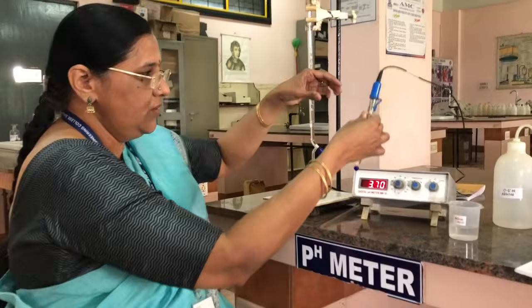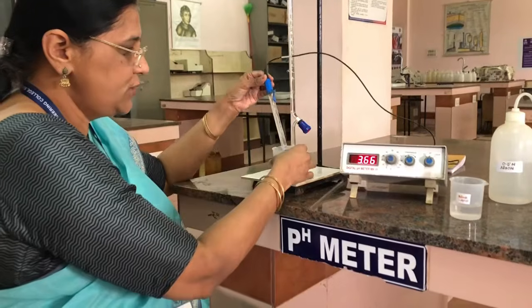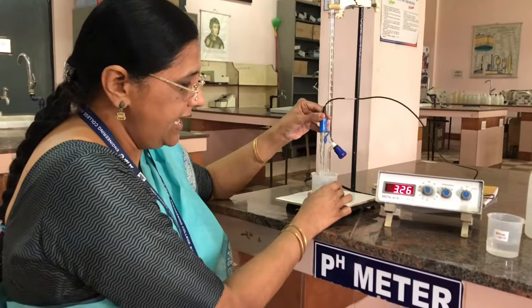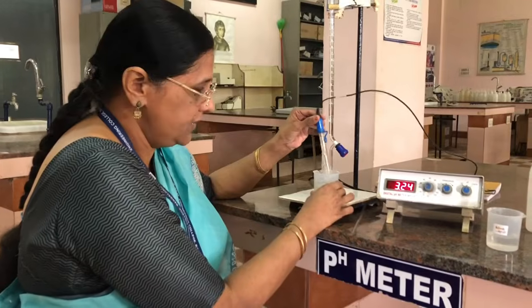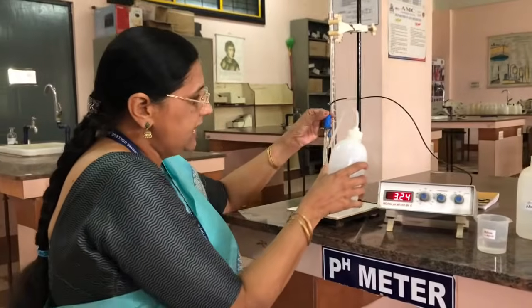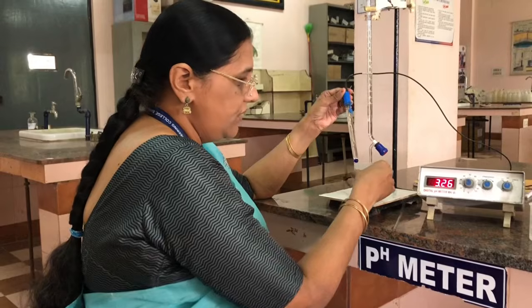Okay, now this electrode which is connected to the pH meter, we have to put it in. First we have to clean it by putting it in distilled water, and we should be very careful with the glass electrode because it is highly sensitive. So first we take distilled water and clean the glass electrode on all sides, and now take it out.